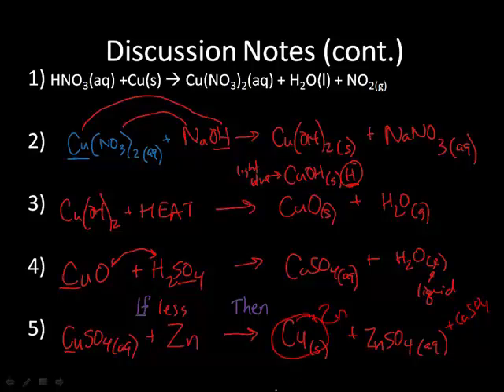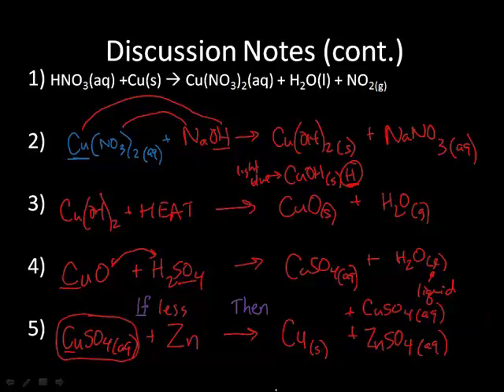And so you could actually get a result where the copper is contaminated with zinc and the mass of this copper substance, what you thought was copper, would be greater than what you originally started with. However, most people, when they do this experiment, see it's still a little bit blue. Some of you may have even seen that in the lab. So if you had extra copper sulfate, if you have excess, then the solution would increase in its bluish color.